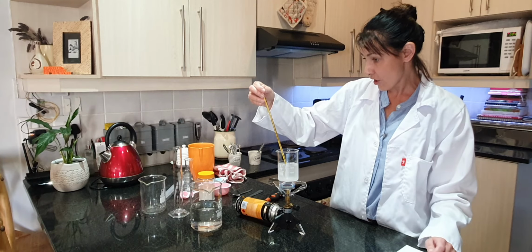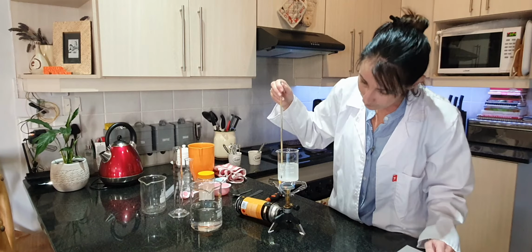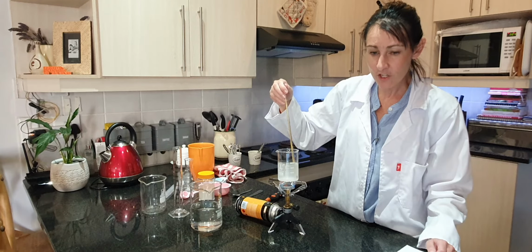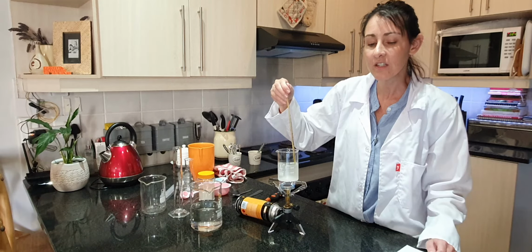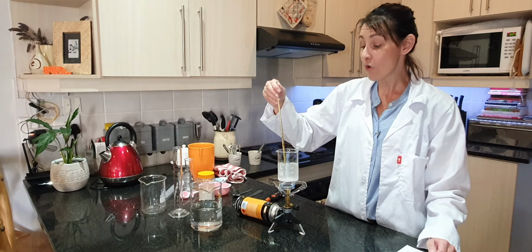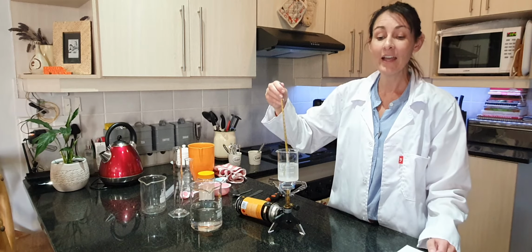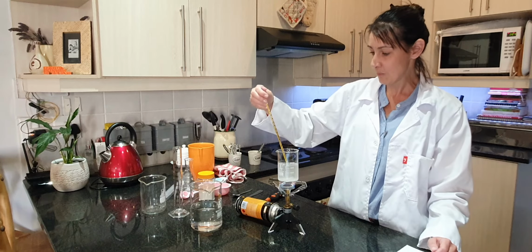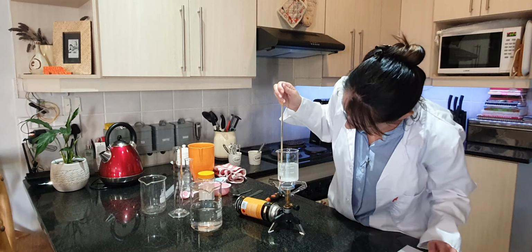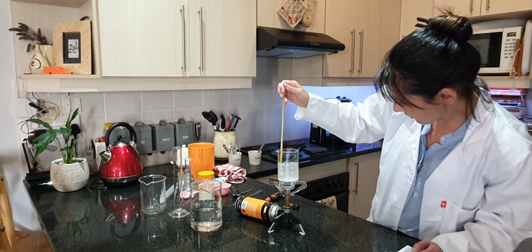Okay, then we are on 74 degrees now. No bubbles yet. Let's see. Name 2 properties of the liquid that influence the value of the boiling point. So unfortunately, I'm not allowed to answer any of these questions for you, but I am just mentioning it to you. Okay, and now we are on 85 degrees. Still no bubbles. Let's see. Stirring it a little bit.